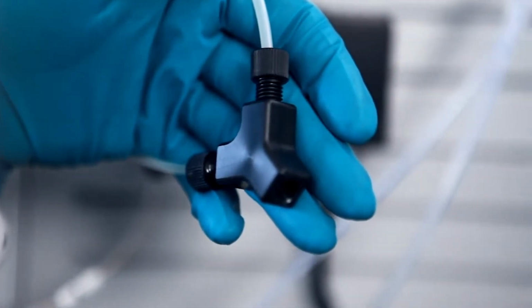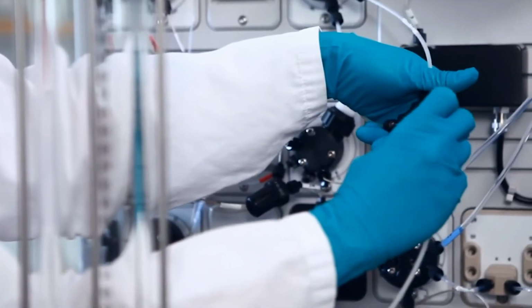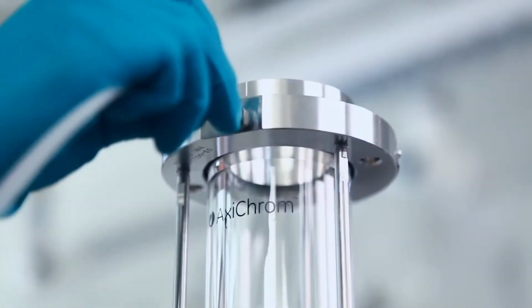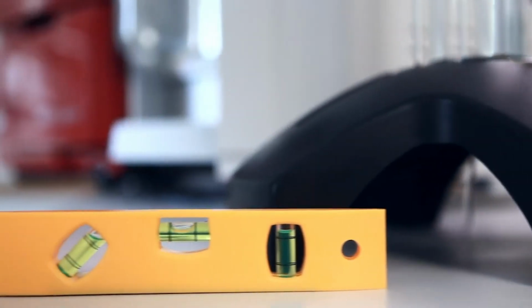Using the T-connector available in the tubing kit, the column is connected to the system with 5 tubes. Make sure that all connections are tight before starting a run, and that the column is level.